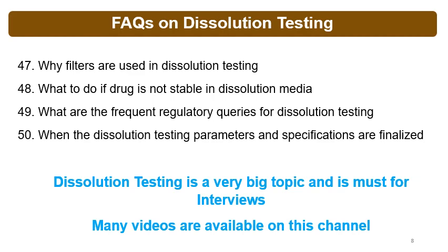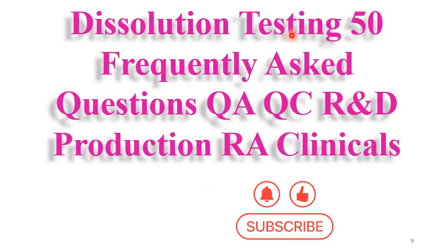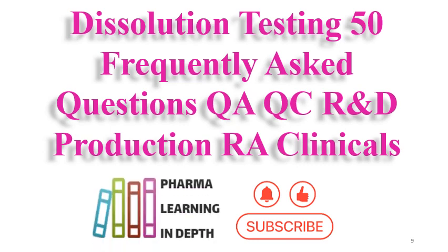Dissolution testing and dissolution specification is a very important testing for oral formulations. It is a very vast topic, and you can go through the videos available on this channel, and you can have a good understanding. So whenever you are going for an interview, always have a good understanding about dissolution testing.